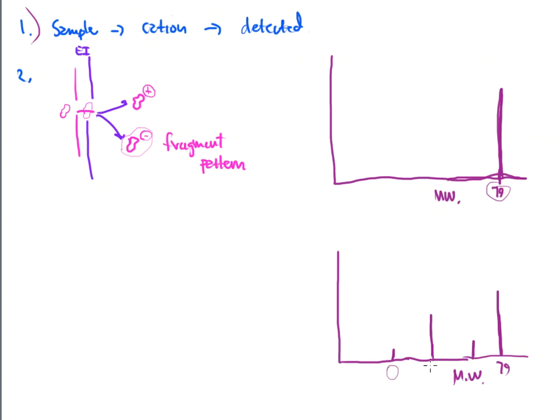And all of these would be different numbers, every single one of them. And each one of these signals will be contributed to the fragment that's getting created when the molecule goes across that electron beam. That is where all these lines are coming from.